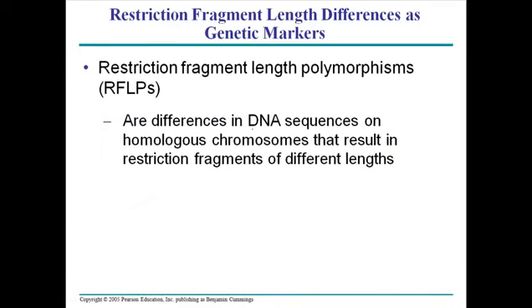In the gel electrophoresis conditions. So another thing, let's talk about the RFLP, or restriction fragment length polymorphisms. It's a mouthful of a name. Restriction fragment means the fragment is generated by the action of a restriction enzyme. Length means it's a length of nucleotides, and it's polymorphisms. Morphisms means the morphology of the DNA, and poly means the morphology comes from different sources. So it's different morphological lengths of the restriction fragments. That's the actual meaning of that.